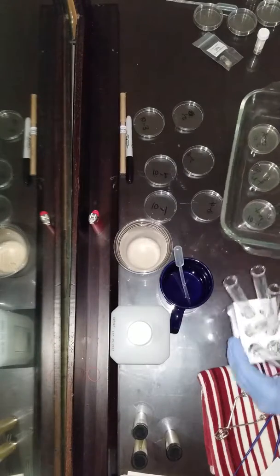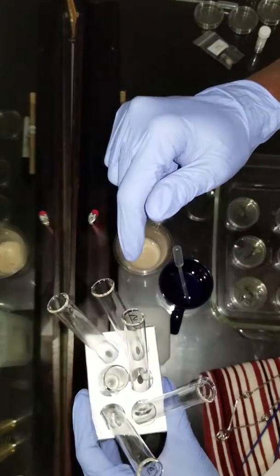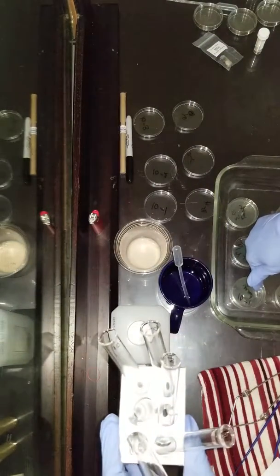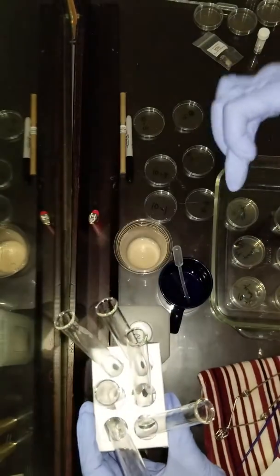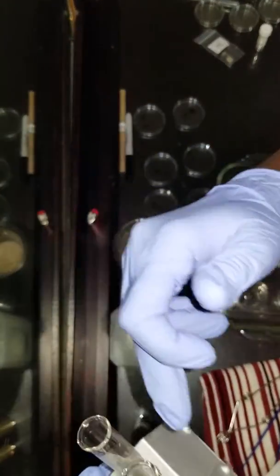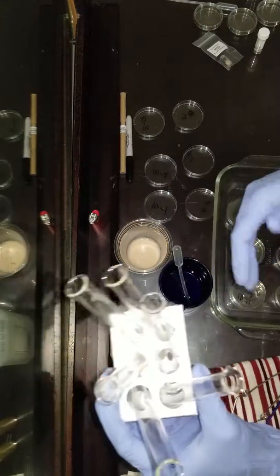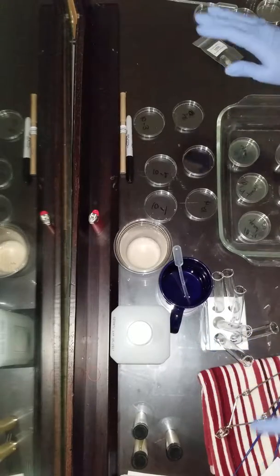And then I dropped 4 drops of 10^-1 respectively into the 10^-1 petri dish of the agar solution, 10^-2 into the 10^-2 petri dish, 10^-3 into the 10^-3 petri dish, the 10^-4 test tube solution into the 10^-4 petri dish, 10^-5 into the 10^-5 petri dish, and of course the 10^-6 goes into the 10^-6 petri dish.